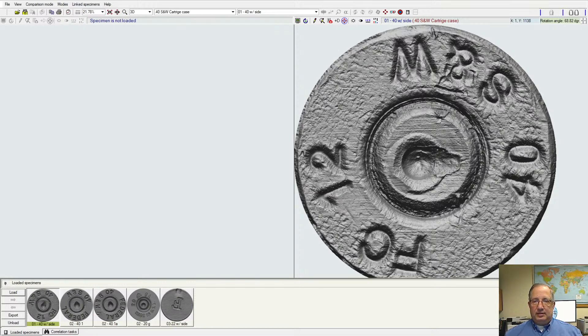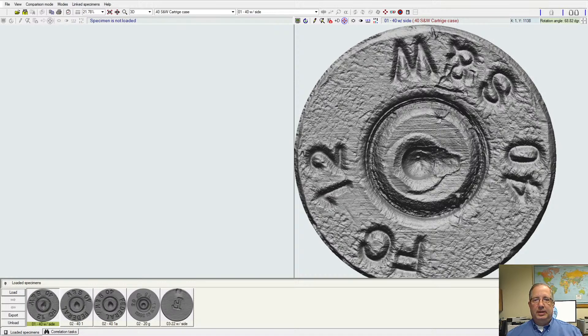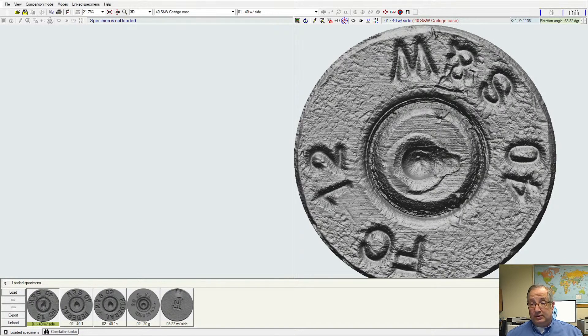Welcome to EvoFound. This is Neil Schrödy with Leeds Forensic Systems and today we are going to talk to you about virtual comparison microscopy and virtual microscopy using the EvoFinder software.